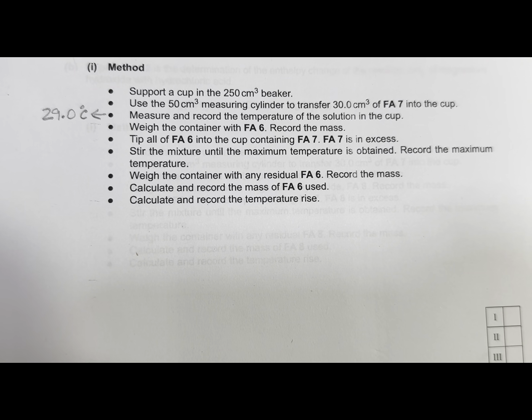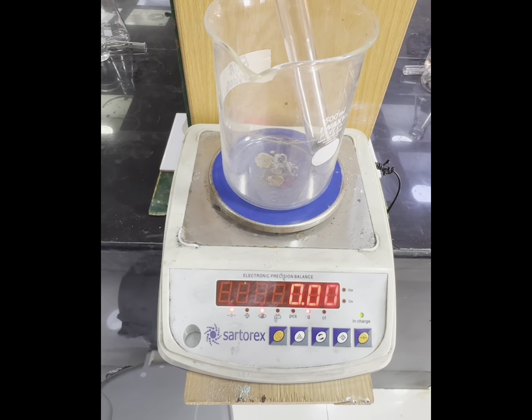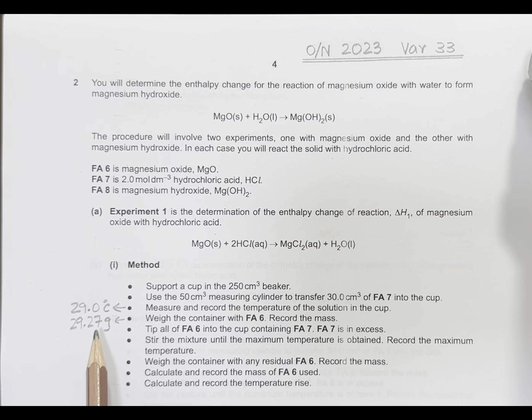The next point says weigh the container with FA6 and record the mass. The recorded mass is 29.27 grams. Tip all the FA6 into the cup containing FA7. FA7 is in excess, which means the hydrochloric acid is in excess.